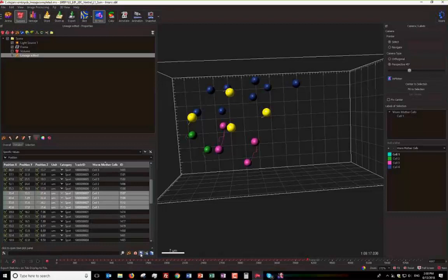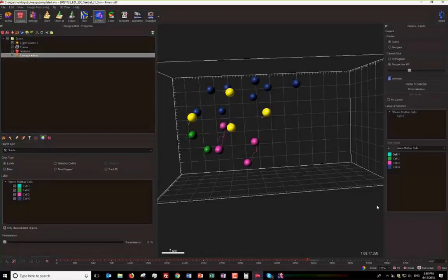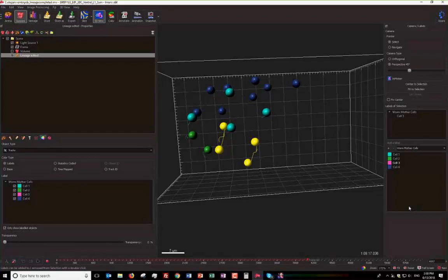Another application for labels is using them as a workflow tool during editing. You can turn the visualization of tracks on and off, and some people use this by assigning a 'done' label to tracks they've finished editing, making all other tracks have a different label, then visualizing only the tracks they're currently working on. This helps speed up their editing workflow. And that really was our goal for 9.2 — to make sure your workflow for working with spots and tracks is as fast as possible.